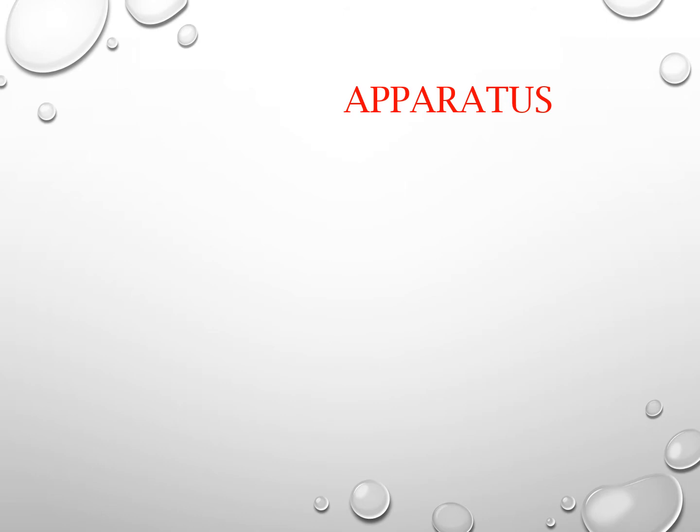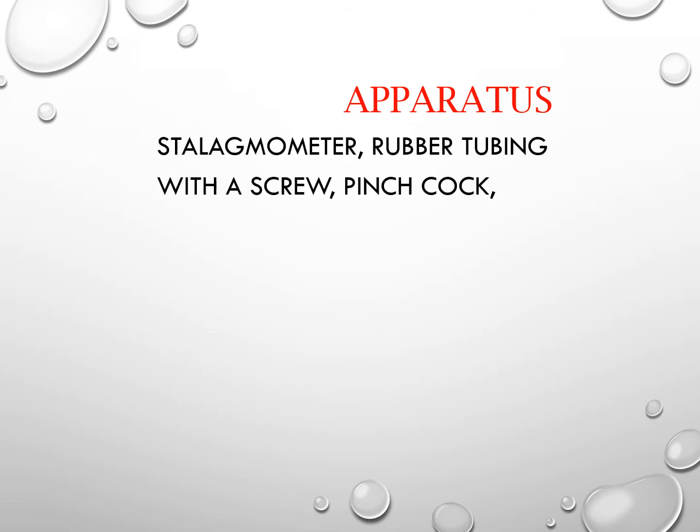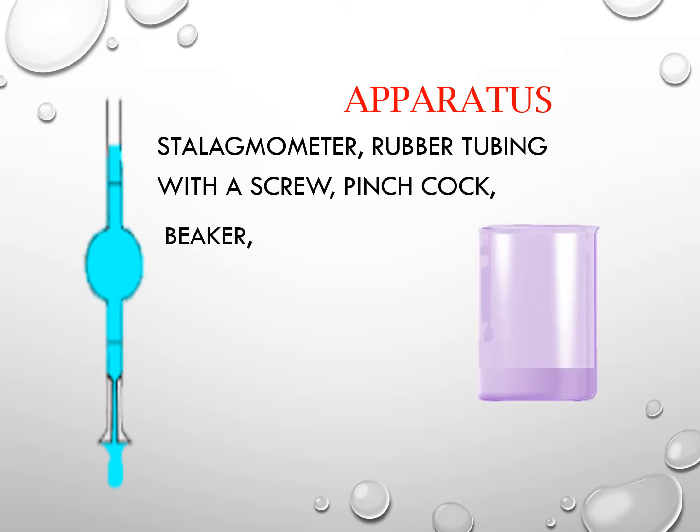Apparatus required: stalagmometer. This is a stalagmometer, rubber tubing with a screw pinch cock, beaker. This is a beaker, clamp. This is a clamp, etc.